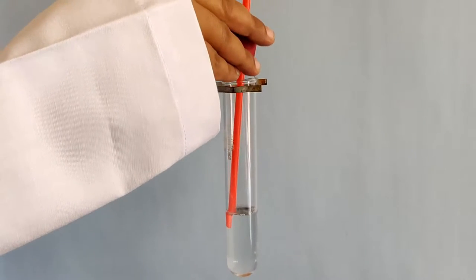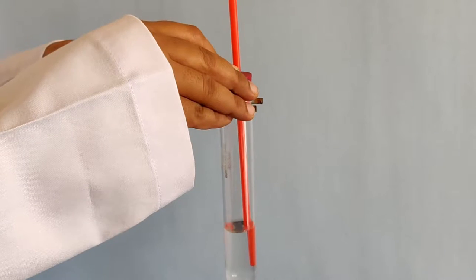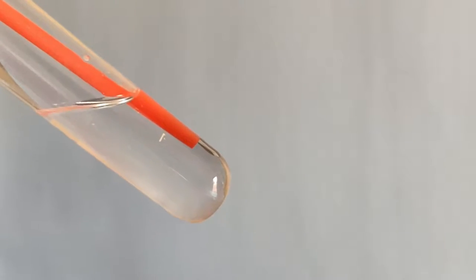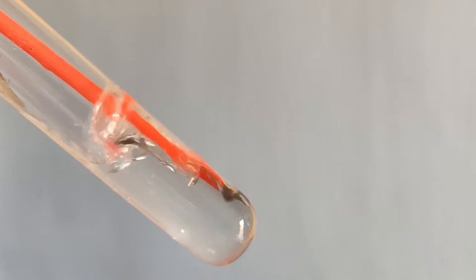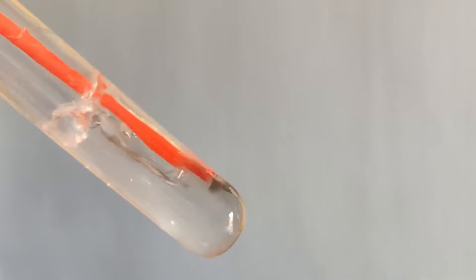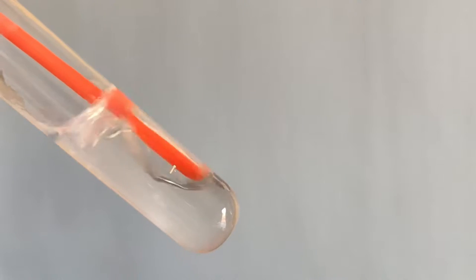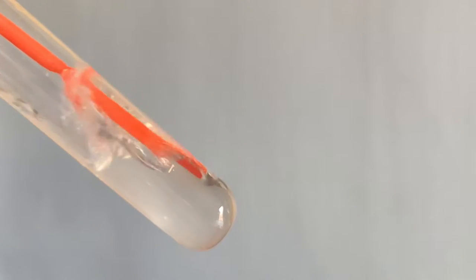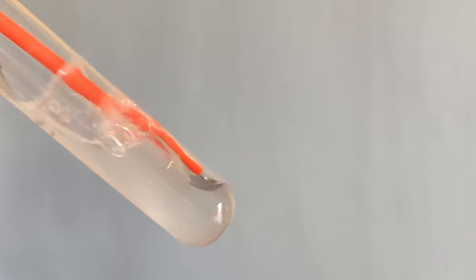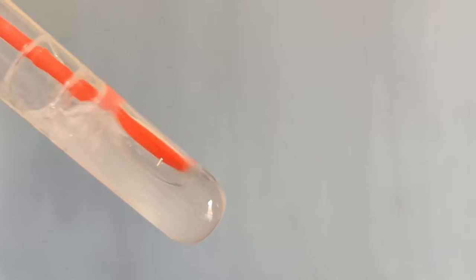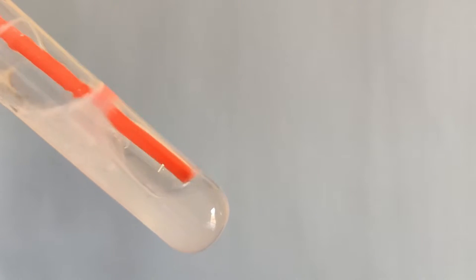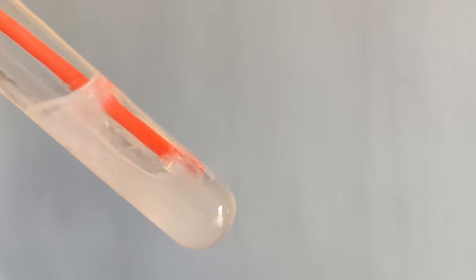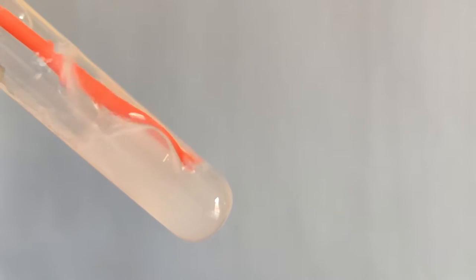Insert a straw into the liquid. Blow into the test tube through the straw for a few seconds. Do you notice any change in the color of the liquid in the test tube?